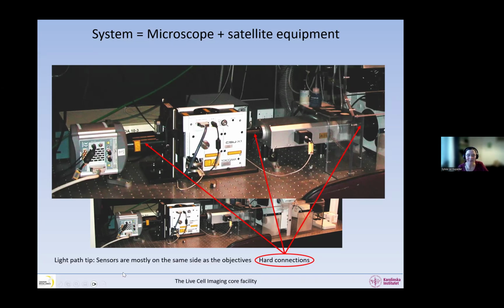So one very important tip as well is, as we said before, the sensors are mostly on the same side as the objective.